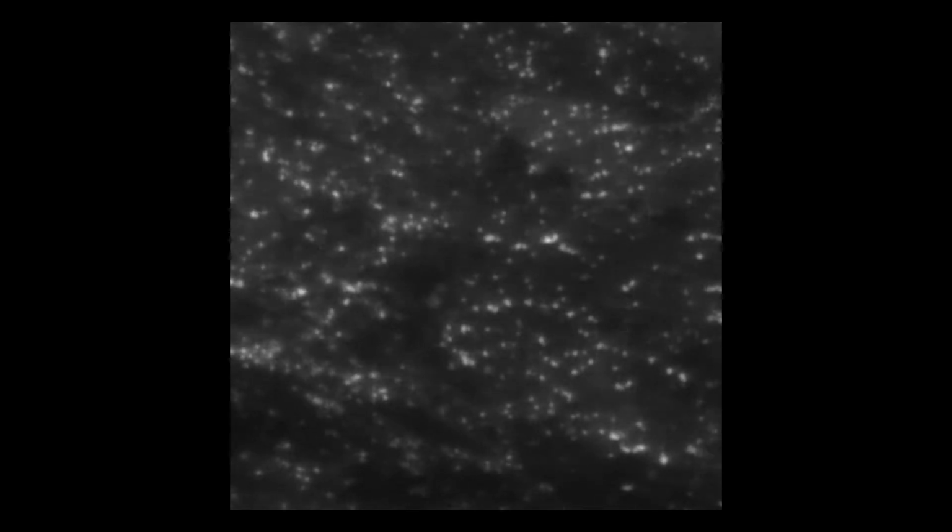And since TIRF microscopy is a wide-field technique, where the images are acquired with a fast sensitive camera detector, it's possible to acquire movies of these living cells to observe dynamic protein behavior. This is a zoomed-in view of one of the cells from the previous slide, showing several minutes of acquisition sped up to video rate to demonstrate the different types of protein interactions with the membrane. TIRF movies like this one can be processed using various automated image analysis routines that quantify protein movement, intensity changes, or even cluster or spot size distributions. All of these image parameters can be used to formulate statistical data about the biological process under examination.